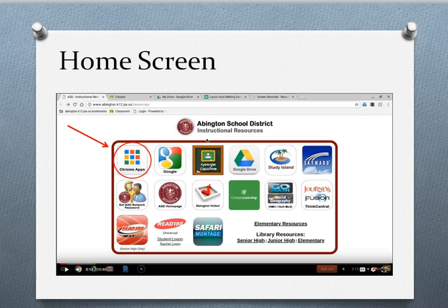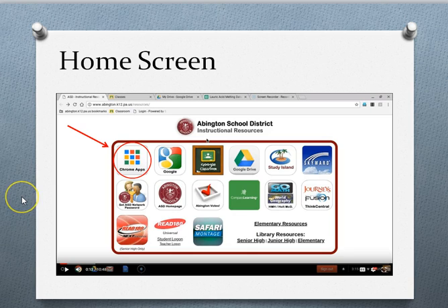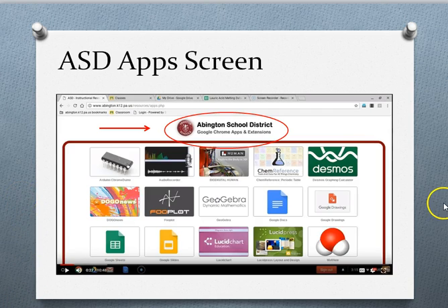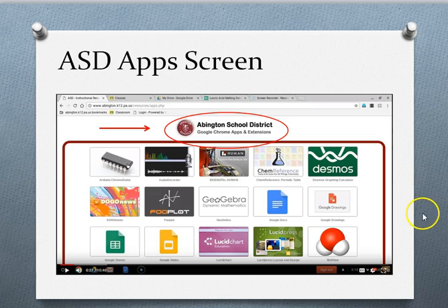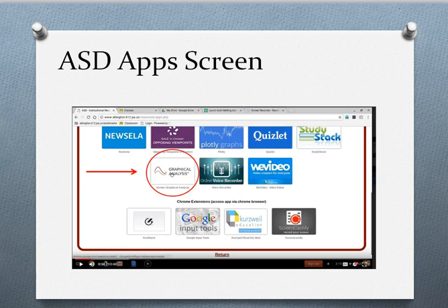Once you log into your Chromebooks, the home screen for the Abington School District Chromebooks looks like this. You'll see over here there is a Chromebook apps — I've got an arrow pointing to it — so you're going to click on that. Once you click on the apps link, it puts you to the home page for the Abington School District apps, and you're going to have to scroll down to find the Vernier app. When you scroll down, it says Graphical Analysis, and there's an arrow — that's the one you're going to click on.